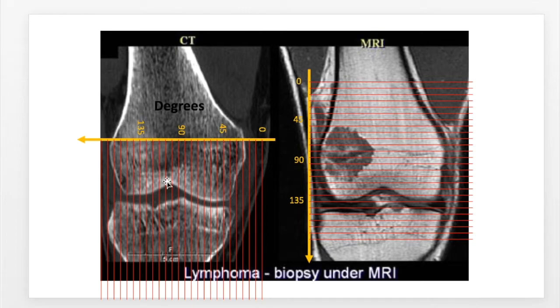In the image on the left side, I put the baseline right at the epiphyseal line, so we can measure maybe the degree of porosity of the bones. What's important to keep in mind is that you have to be consistent in measuring every image in a study the same way. Otherwise, your data would make no sense.